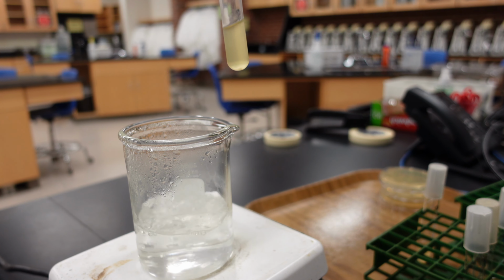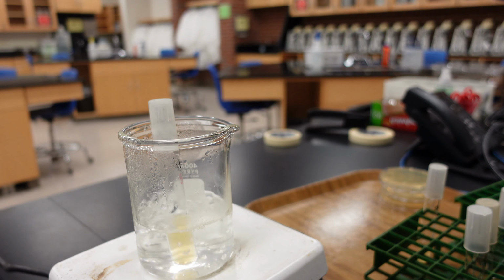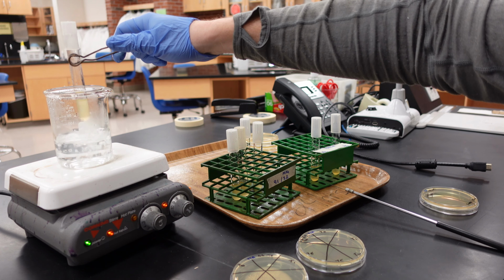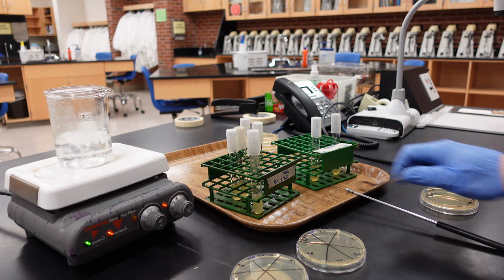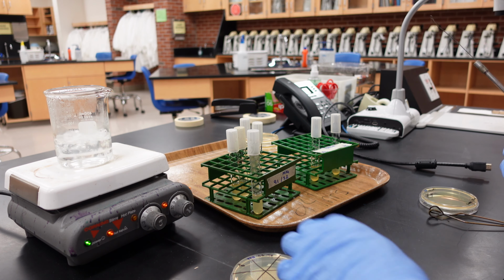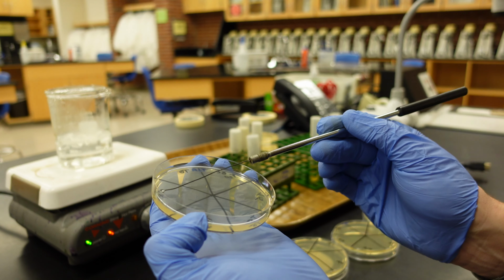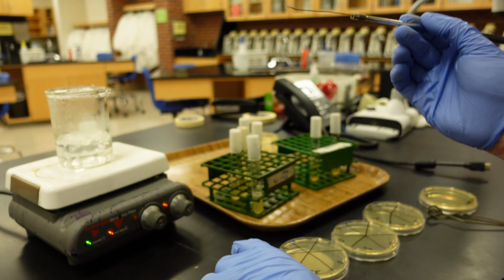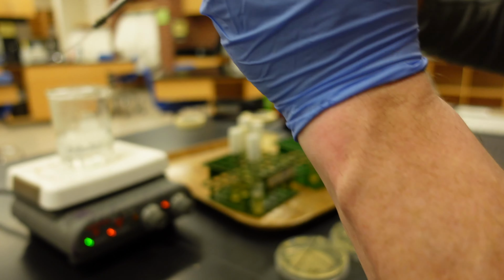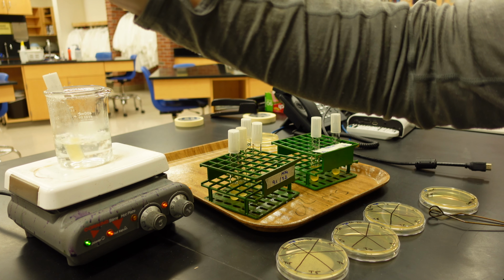So I'm going to place the Bacillus cereus in the water, and I'm going to set a timer for 1 minute and then take it out and take a sample. Alright, so it's been 1 minute. I'm going to put this on the time 1 spot on the plate. This is this tryptic soy agar. And I'm going to place the tube back into the boiling water for 1 more minute and then take another sample.